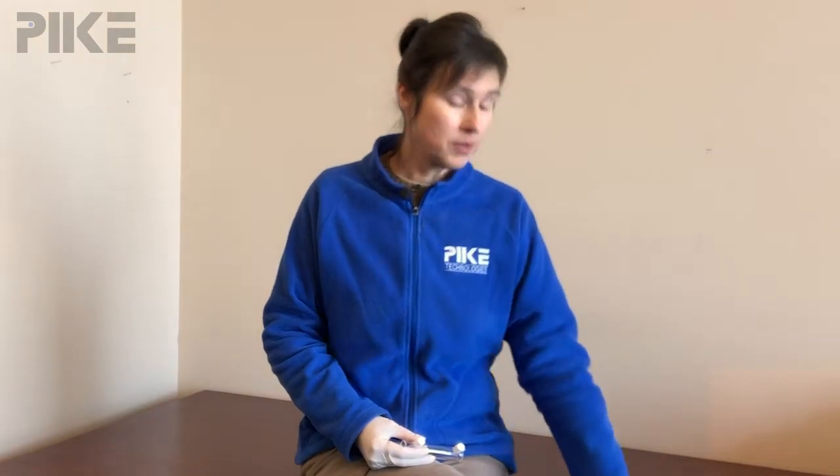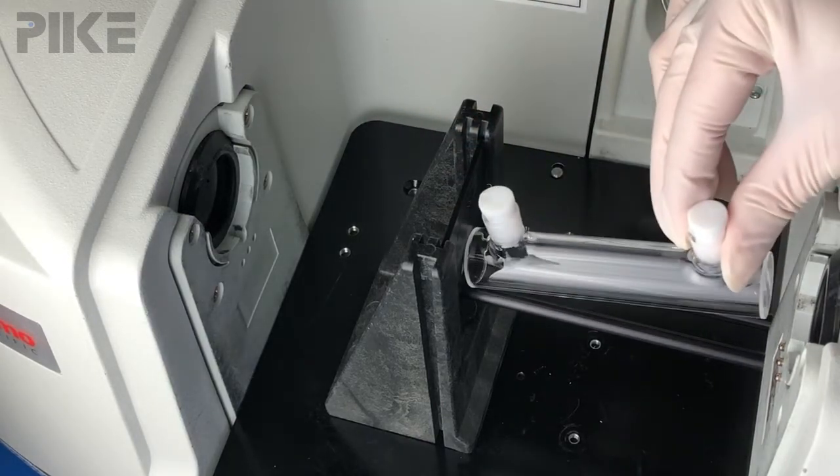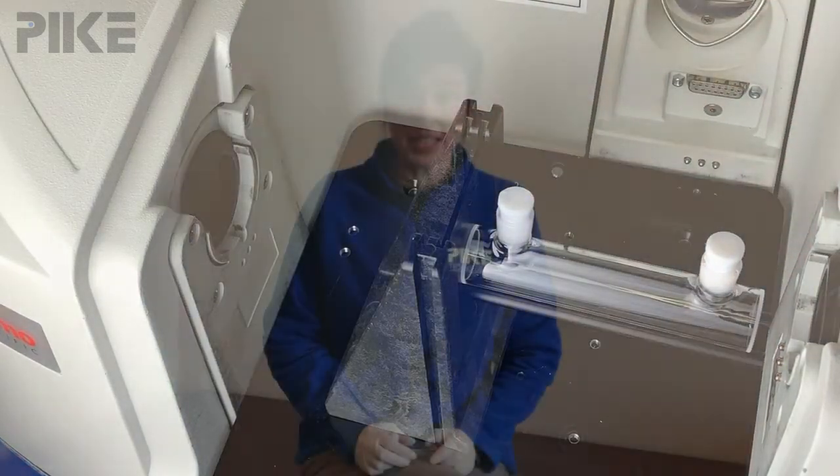So how do we go about holding these cells in the beam path? Each one will have a holder that will fit right into the slide mount of your accessory. Place the holder in the slide mount and then place the cylindrical cell on the legs of the holder.